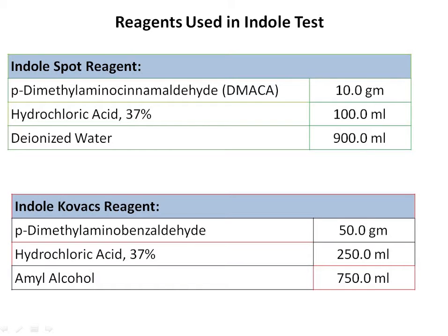Now let's discuss what is the procedure of the IMViC test. In the IMViC, the I stands for indole test. So let's first discuss the indole test.